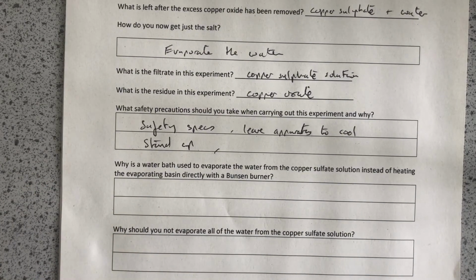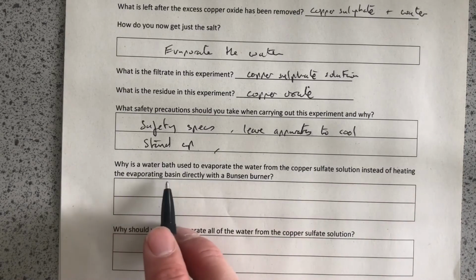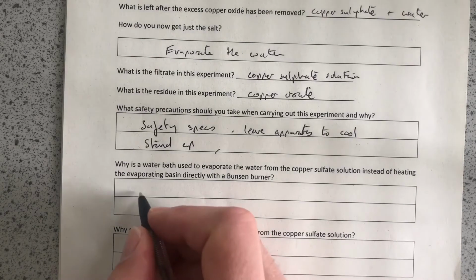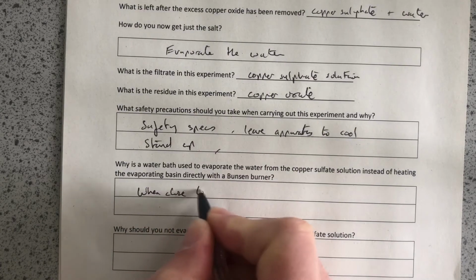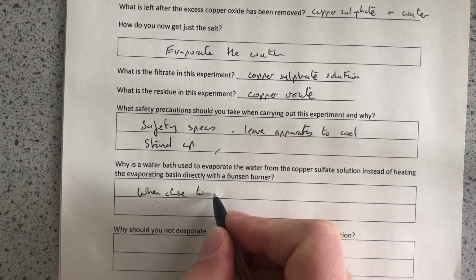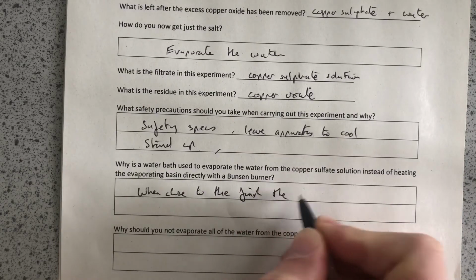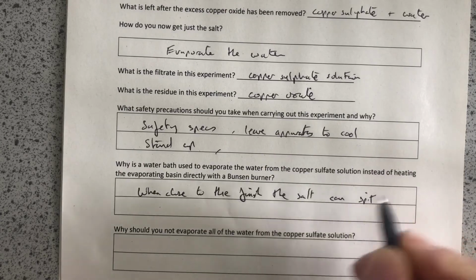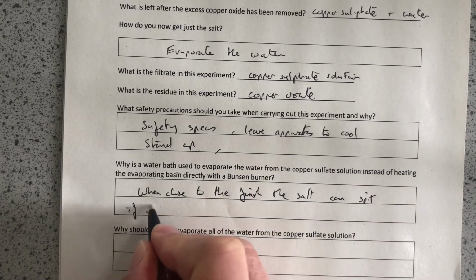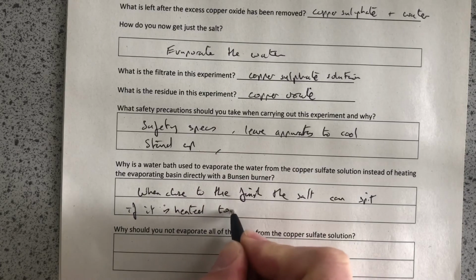Why is a water bath used to evaporate the water from the copper sulfate solution instead of heating the evaporating basin directly with a Bunsen burner? When close to the finish, the salt can spit if it is heated too strongly.